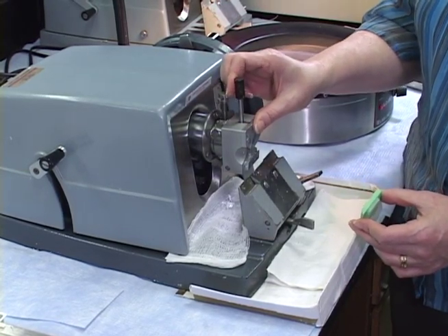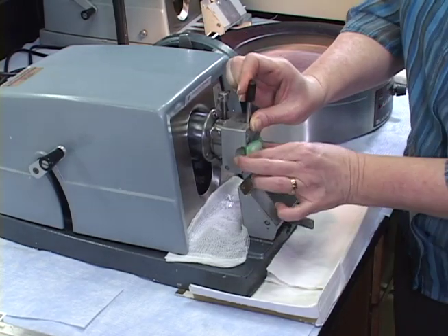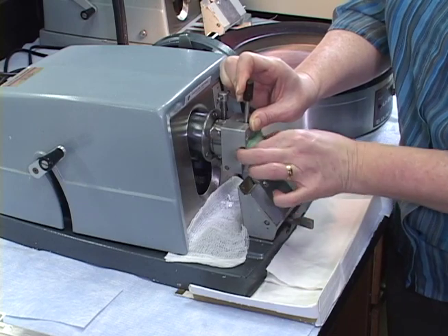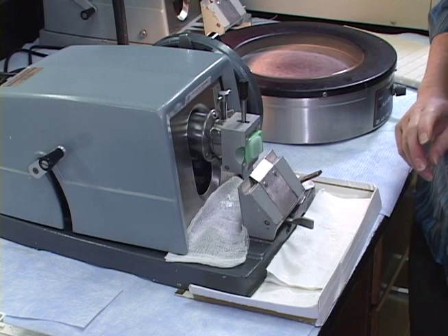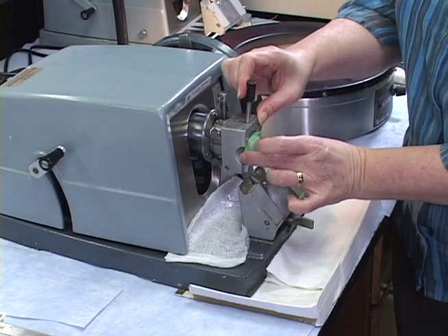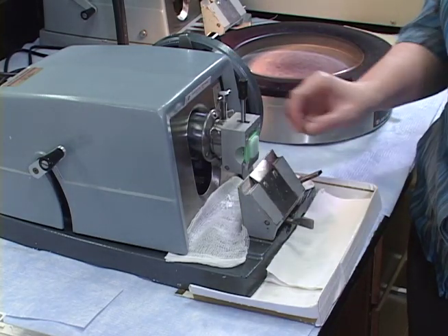Again, you leverage it with your thumb here in the front, and your fingers pull it forward, and you can put the chuck in. Make sure it's nice and straight, because you can get it kind of crooked like this, and then you can chunk your block and have a problem. It's very easy to do that. So make sure you get it in, centered, and fully released, and it's in there nicely.